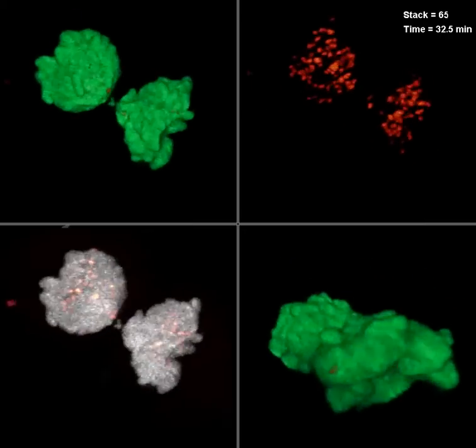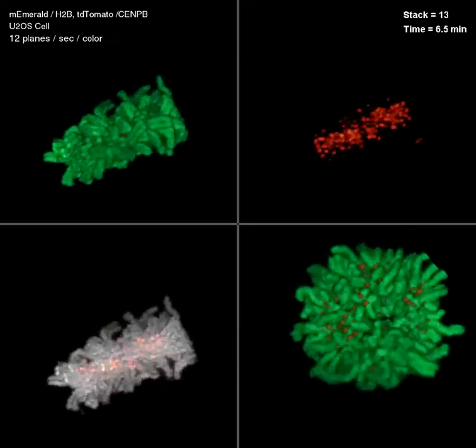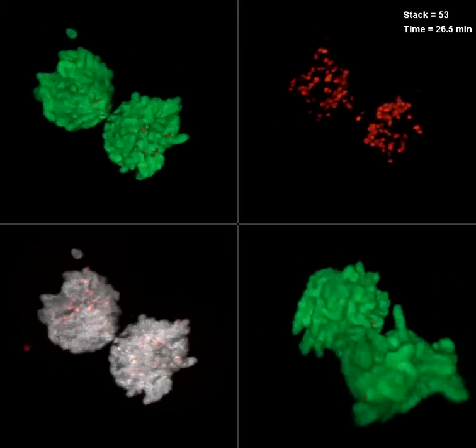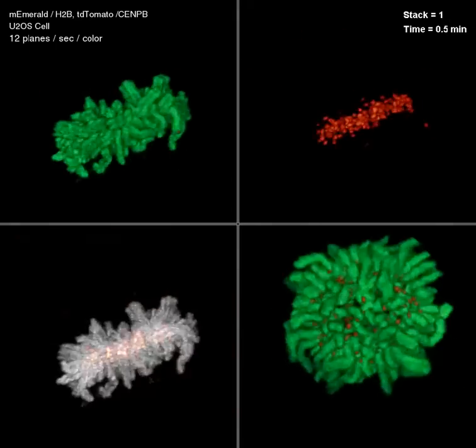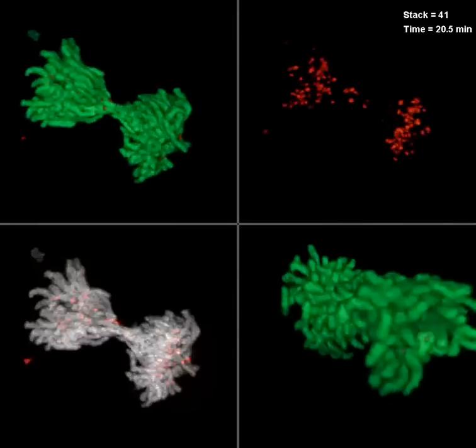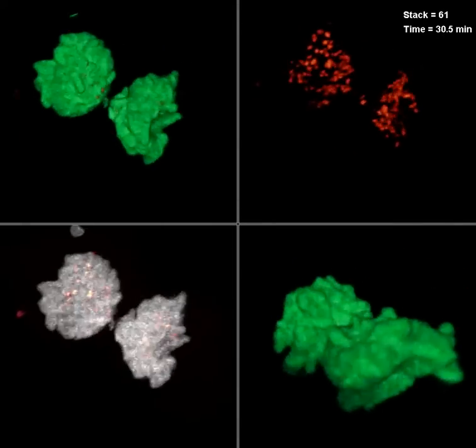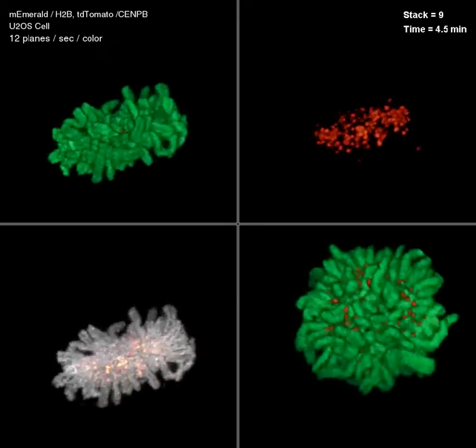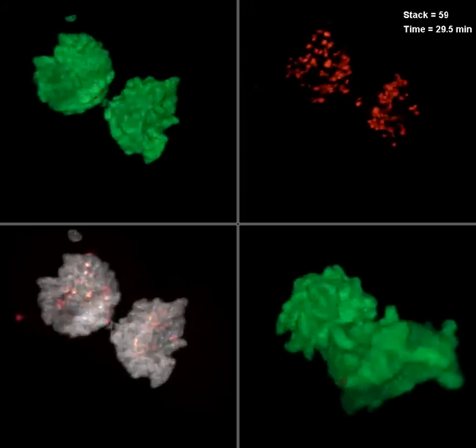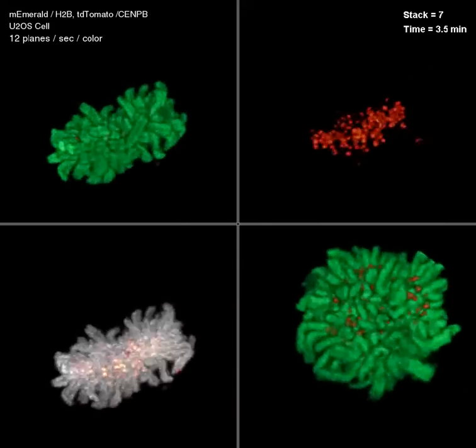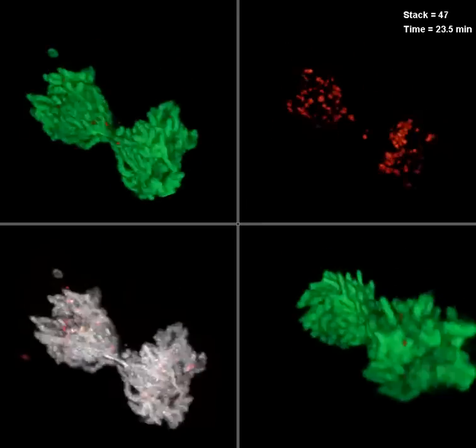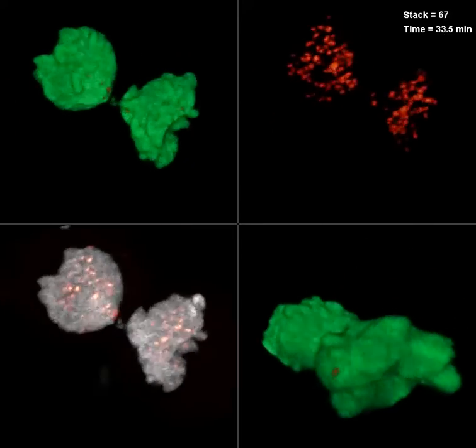As that movie proceeds, there's a second part where you start to see this little flash, flash, flash of different pairs of chromatids and their kinetochores in orange. And what that's demonstrating is that the 4D resolution in this movie is good enough, coupled with the two-color imaging we're doing to see both the kinetochores and the chromosomes, that you can actually identify each chromosome by its shape and the position of the kinetochore.